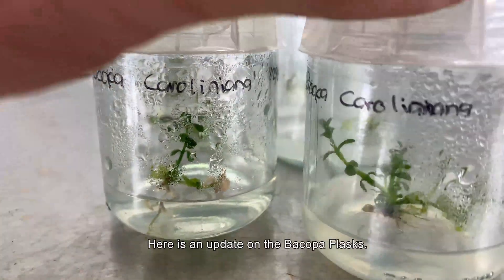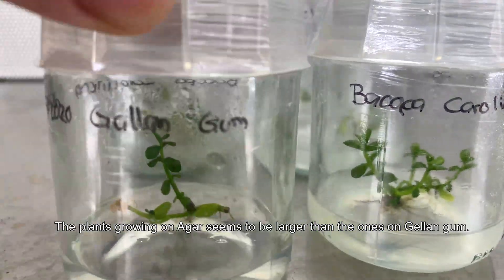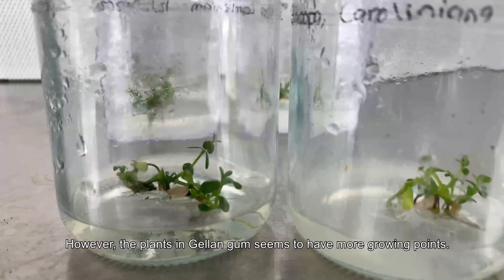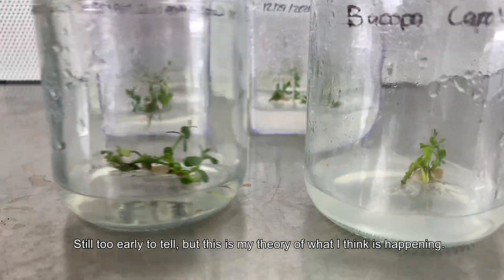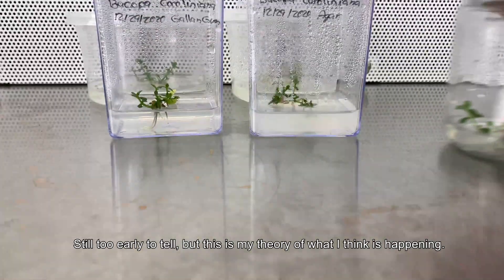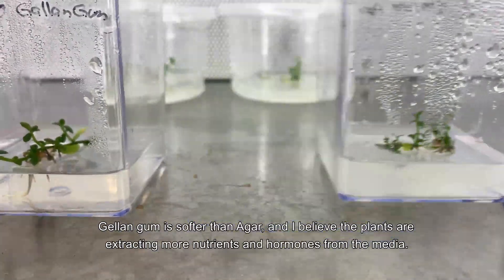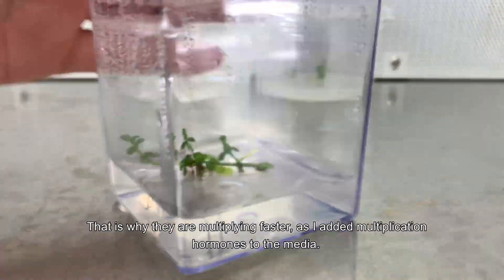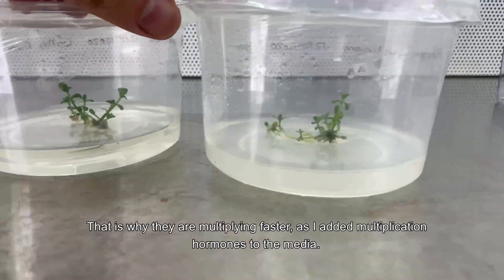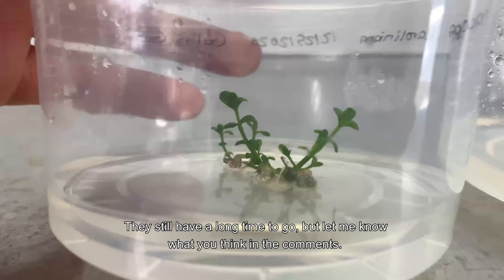Here is an update on the bacopa flasks. The plants growing on agar seem to be larger than the ones growing on gellan gum; however, the plants in gellan gum seem to have more growing points. It's still too early to tell, but my theory is that gellan gum is softer than agar, so the plants are extracting more nutrients and hormones from the media — that's why they are multiplying faster, since I added multiplication hormones to the media. Let me know what you think in the comments.